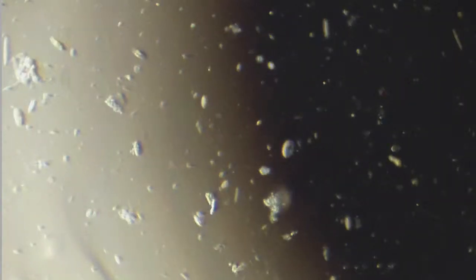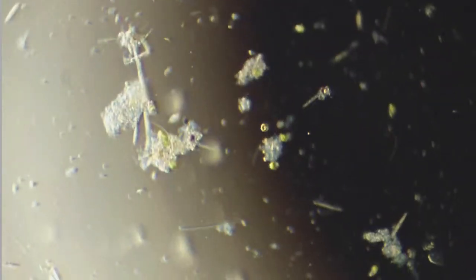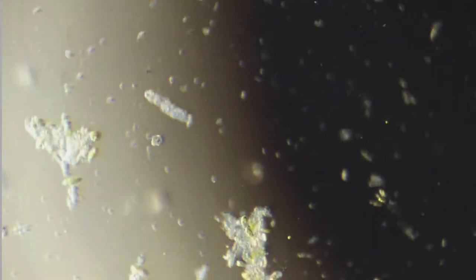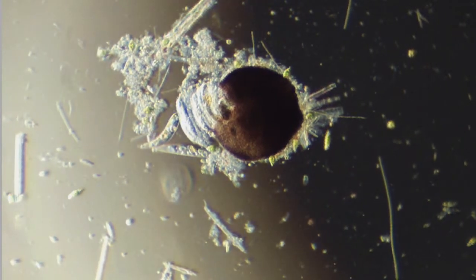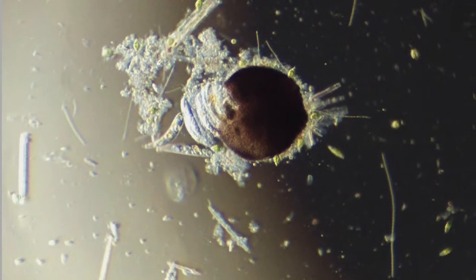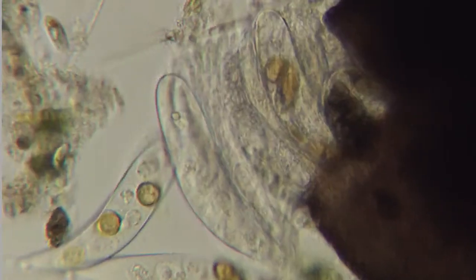Let me go back out. I just lost that guy. So you get pretty complicated actions inside of a cell, whether it's going into the nucleus or going to other parts of the cell or being processed to release into the body. Wow, look at that. That's crazy. I have no idea what that is. Look at all that.